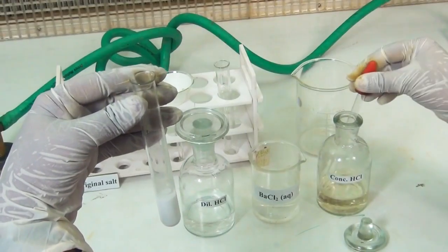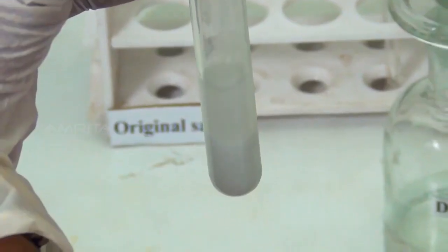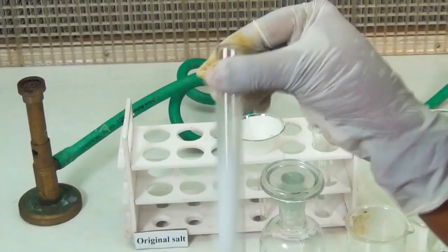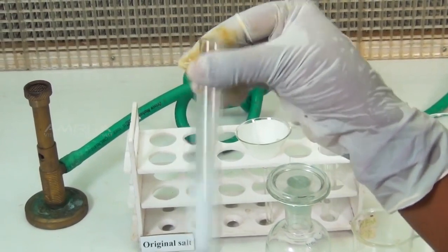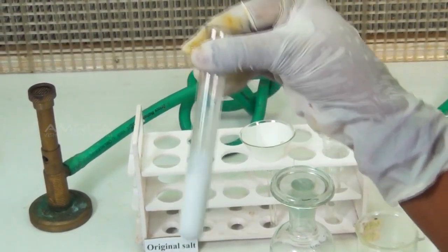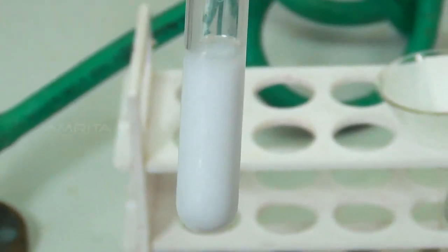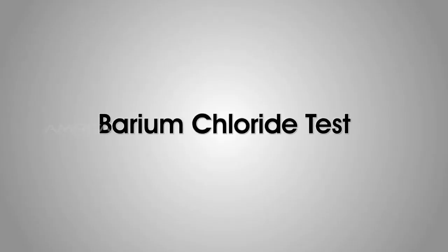Using a dropper, add a small amount of concentrated hydrochloric acid to the white precipitate. Shake the contents of the test tube well. The white precipitate is insoluble in concentrated hydrochloric acid, indicating the presence of sulphate. Next, we look at the confirmatory tests of sulphate. Barium chloride test.